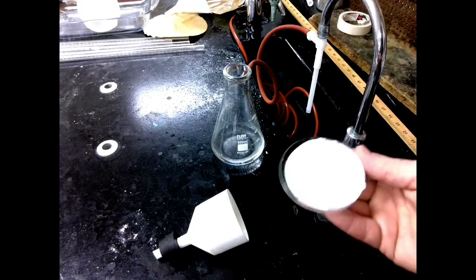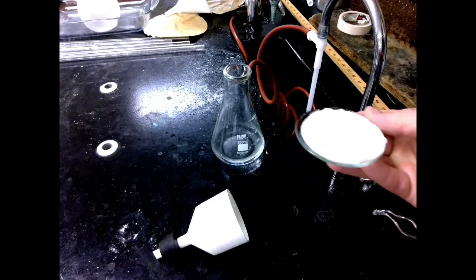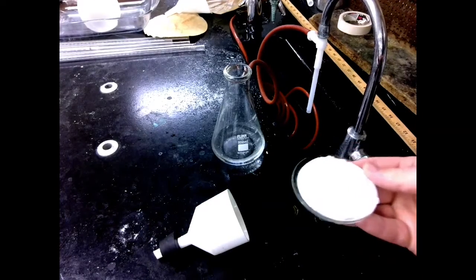So you can see I've got a lot of aspirin here. Lots and lots of aspirin. So I'm going to place this in the drying oven overnight.